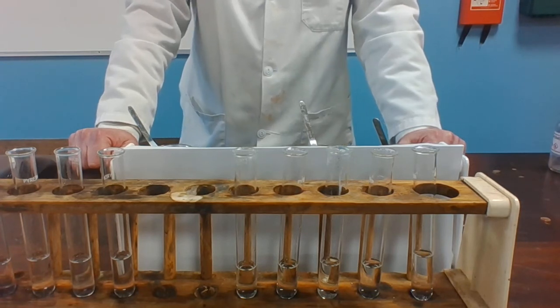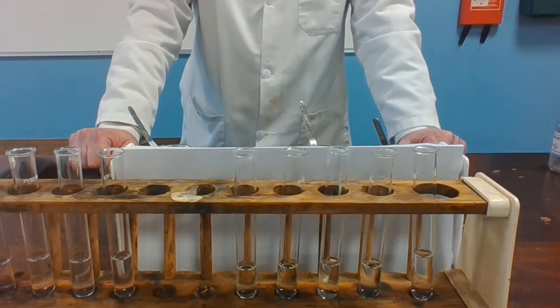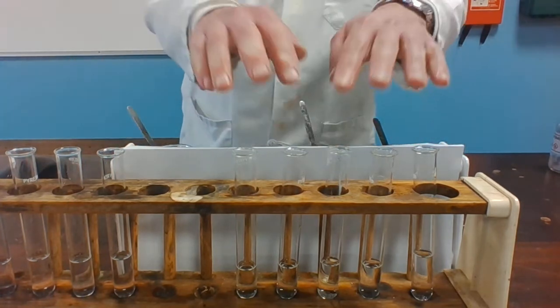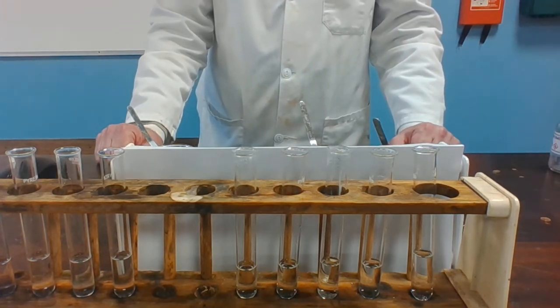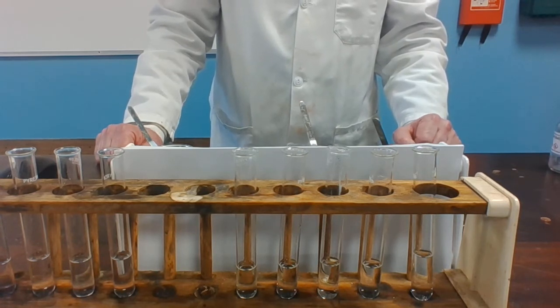In this experiment we are going to look at the reaction with water, the reaction with dilute hydrochloric acid, and a couple of displacement reactions. We'll start off with reaction one, the reaction with water. In each of these five test tubes there is some distilled water, and I'm going to add copper, zinc, lead, magnesium, and iron to the water. I would like you to look to see if there's any evidence of a reaction and write your observations in the table.